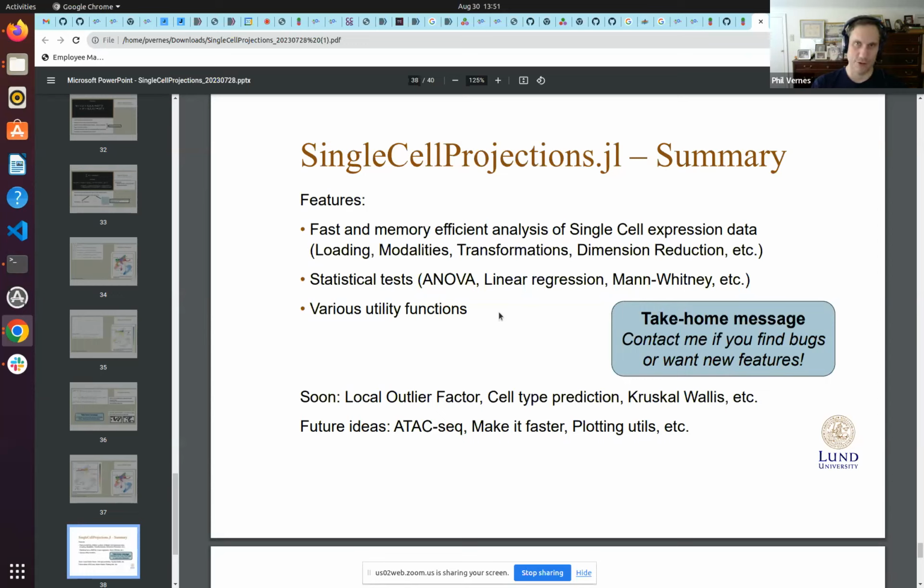If there are any other questions on the floor, I have a couple before we wrap. Where does this plug into the single cell analysis workflow, post alignment / feature assignment? Is this designed to be downstream of the Cell Ranger exclusively? For Python / R users, would you say just diving in with this package would be an okay place to learn using Julia? That's a good question.